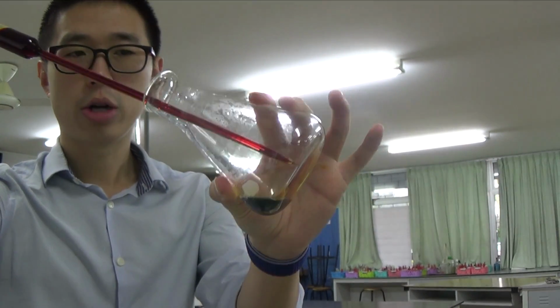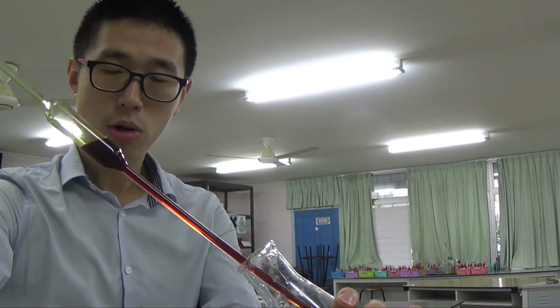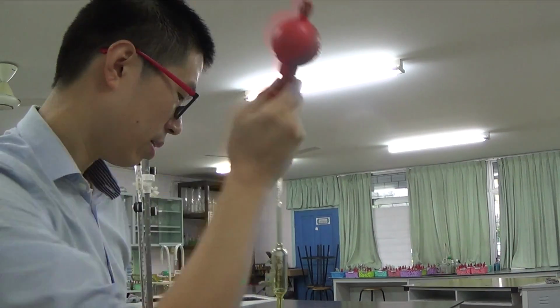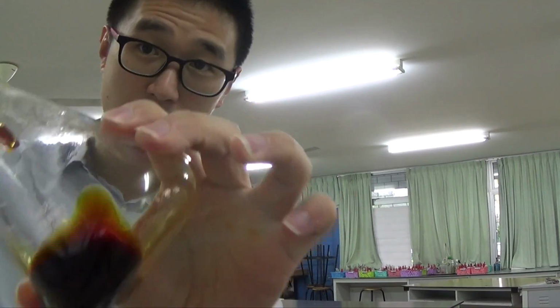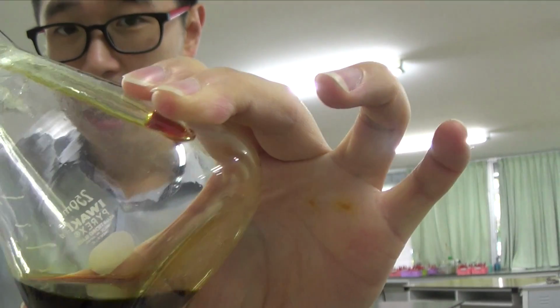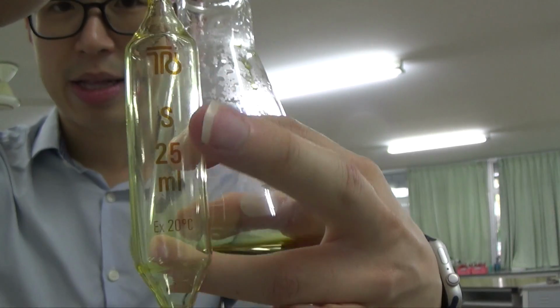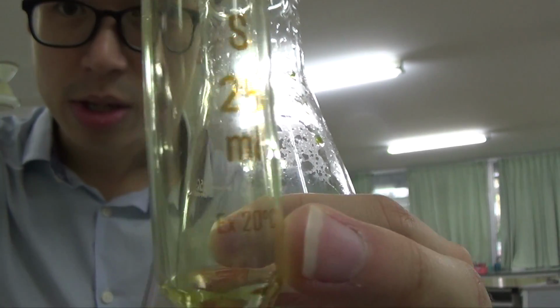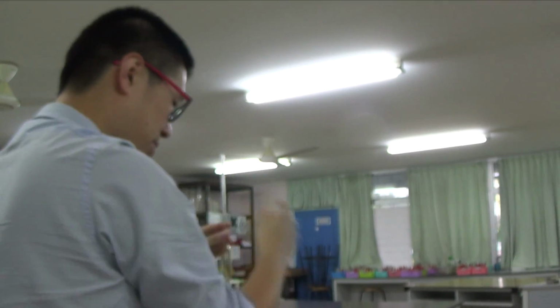As I mentioned, your conical flask can be a little bit wet with some water. It's alright, because whatever you prepare out is an exact volume, therefore exact mole, of the iodine solution. So it doesn't really matter that you add a bit of water. Take out your pipette filler. This thing is brown in solution, so you see a little bit of droplet at the end there. You're not going to get everything out, but tap very gently. 1, 2, 3, 4, 5, 6, 7. You're still going to be left with one drop at the end. That is taken into account by the level of accuracy of the apparatus. As you can see, it says plus minus something. That is alright.